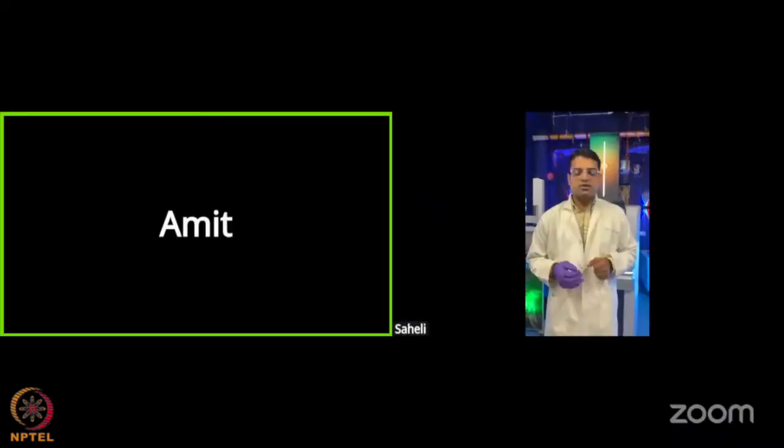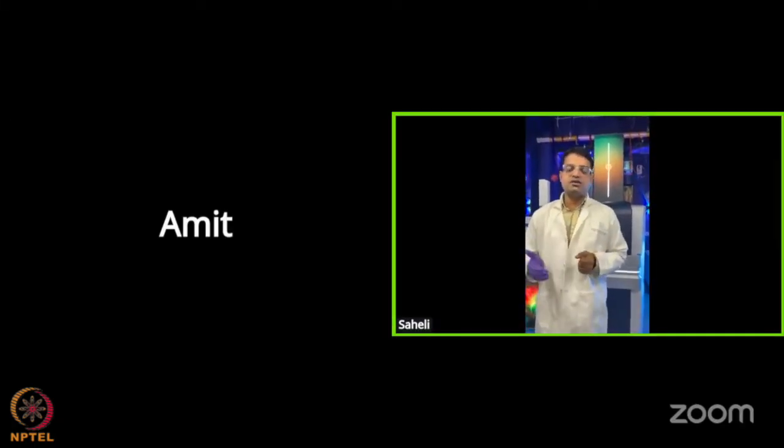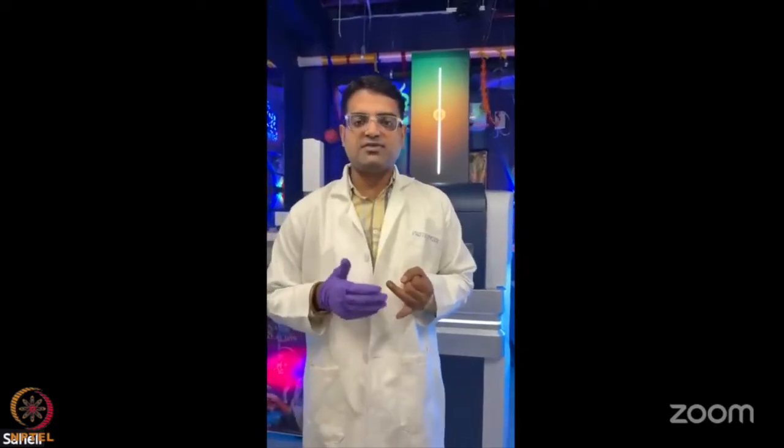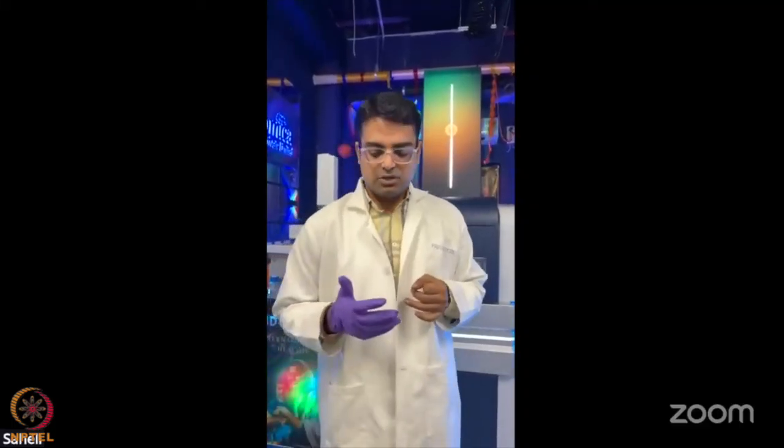So welcome everyone. What you are seeing is India's first TIMS facility. To give a brief background, you have seen mass specs which can do a three-dimensional separation in the form of RT, m/z, and intensity. This is the first mass spec, the timsTOF Pro, which can do a separation on the fourth dimension, that is based on the cross-sectional area. Let's move on, I will explain that later.